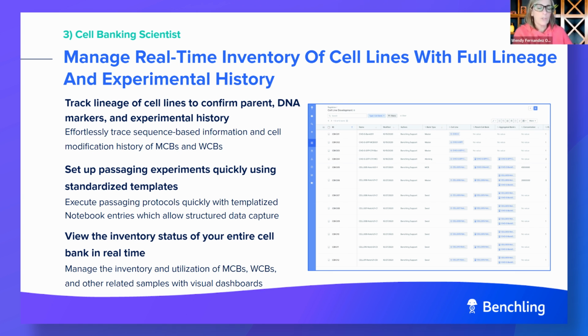Last but not least, we're going to talk about the cell bank team. This team supports the entire organization, maintaining cell lines, managing the cell banks, expanding those banks when requested by other teams for experimentation. But for this team, it's essential to track the lineage of the cell lines and have easy access to the history of the master and working banks.